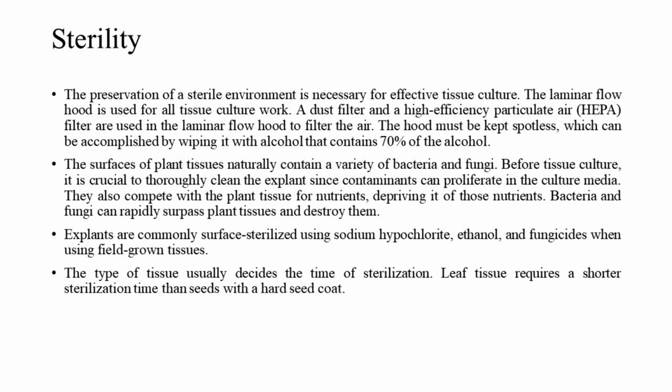The surfaces of plant tissues naturally contain a variety of bacteria and fungi. Before tissue culture, it is crucial to thoroughly clean the explant since contaminants can proliferate in the culture media. They also compete with the plant tissue for nutrients, depriving it of those nutrients. Bacteria and fungi can rapidly surpass plant tissues and destroy them.